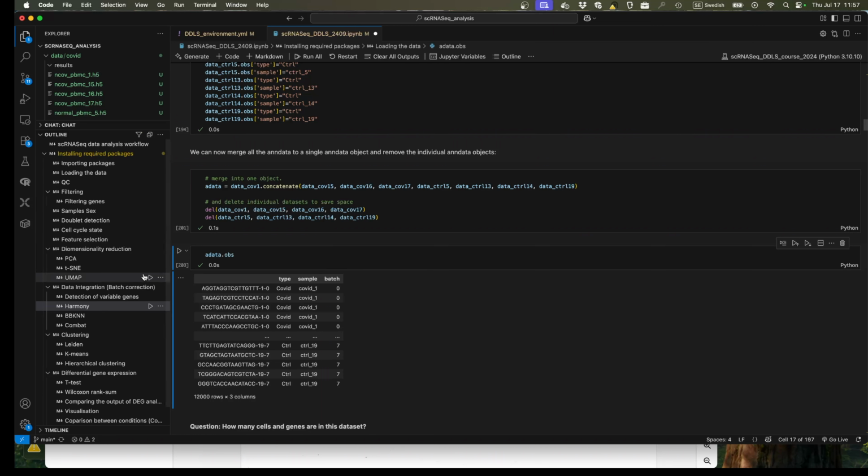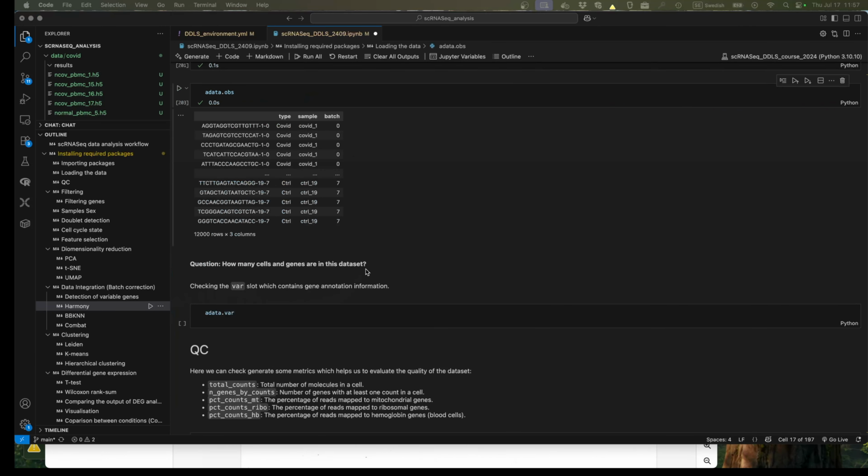We already answered this question, which is asking us how many cells and genes are in this data set.